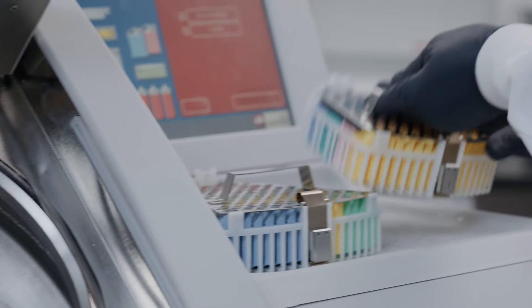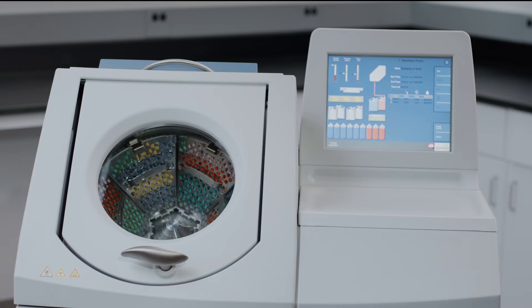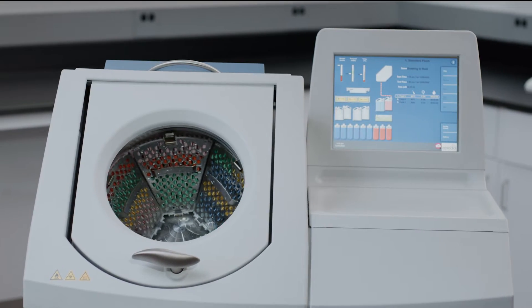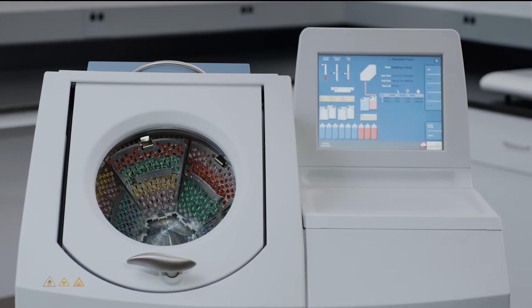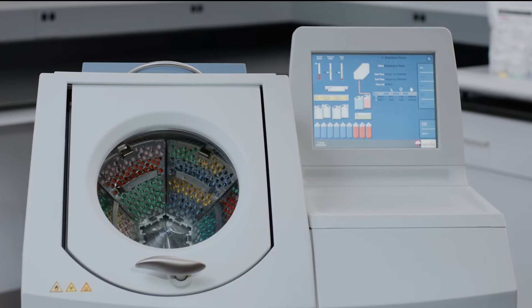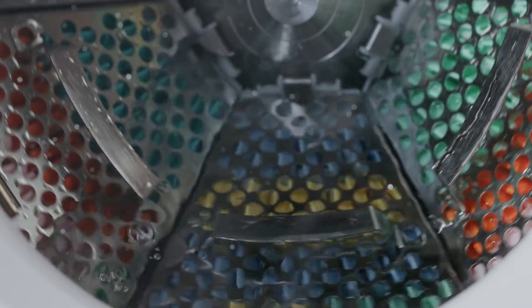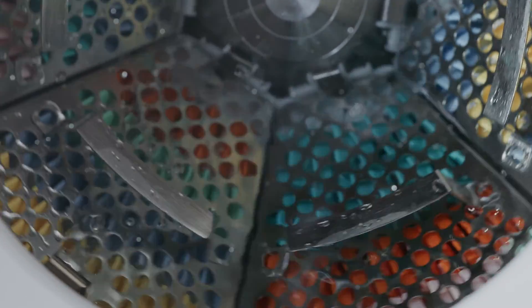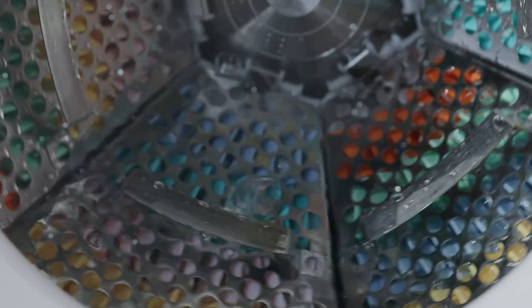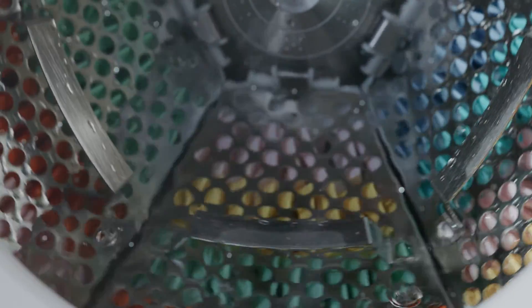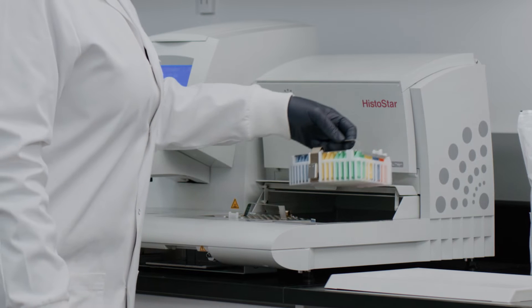Unlike conventional tissue processors that use tidal agitation, the Revos system uses rotational agitation, penetrating the tissue faster and more gently. Rotational agitation in comparison to tidal agitation can improve your lab's fluid exchange efficiency by seven times, resulting in excellent tissue processing quality.